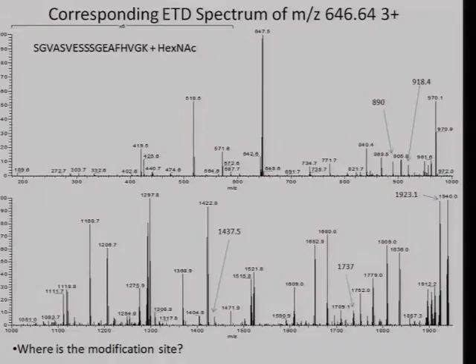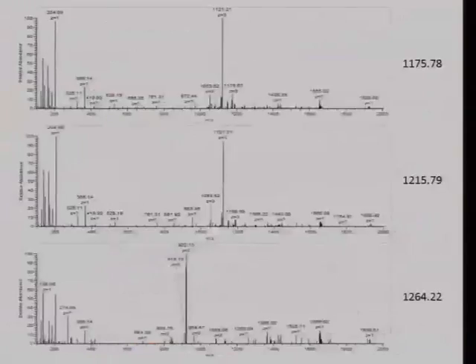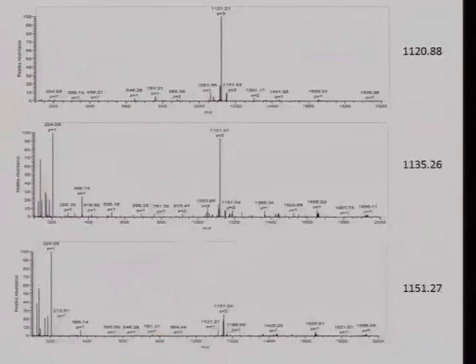So certain cleavages are very heavily favoured. For example, in collision-induced dissociation, cleavage N-terminal to a proline is always very big. But this peptide doesn't have a proline in, so that's not an example here. But it's very difficult from the intensity to say anything particularly useful. I don't know what else. But, yeah.